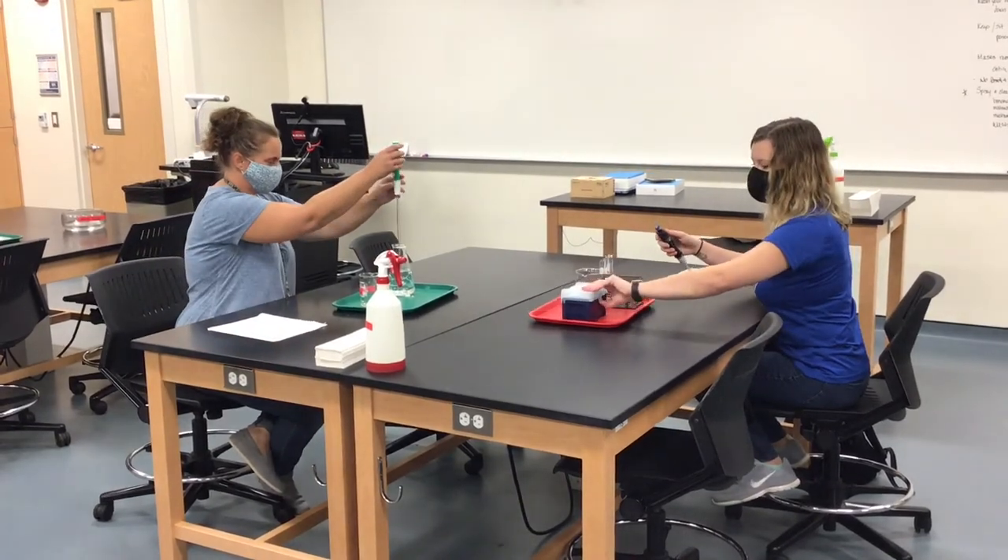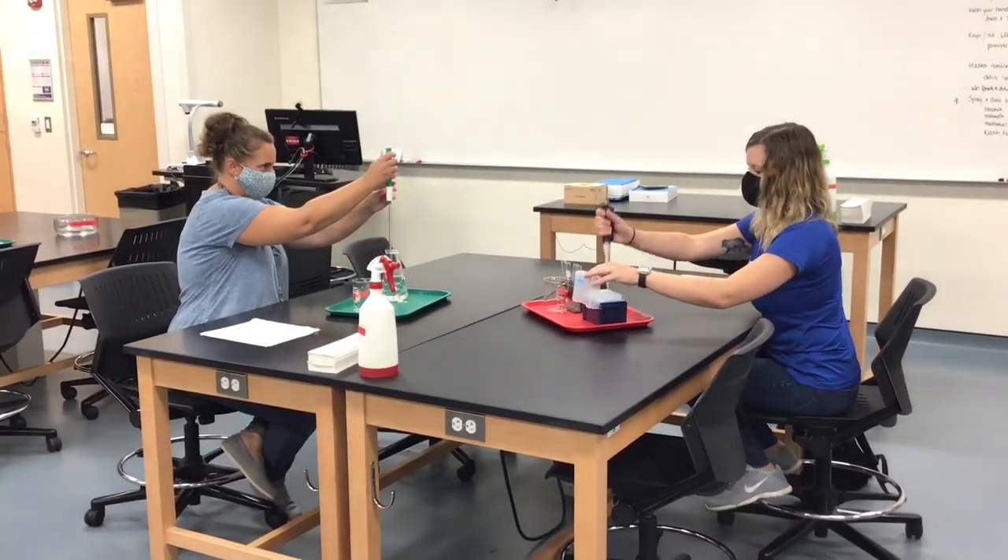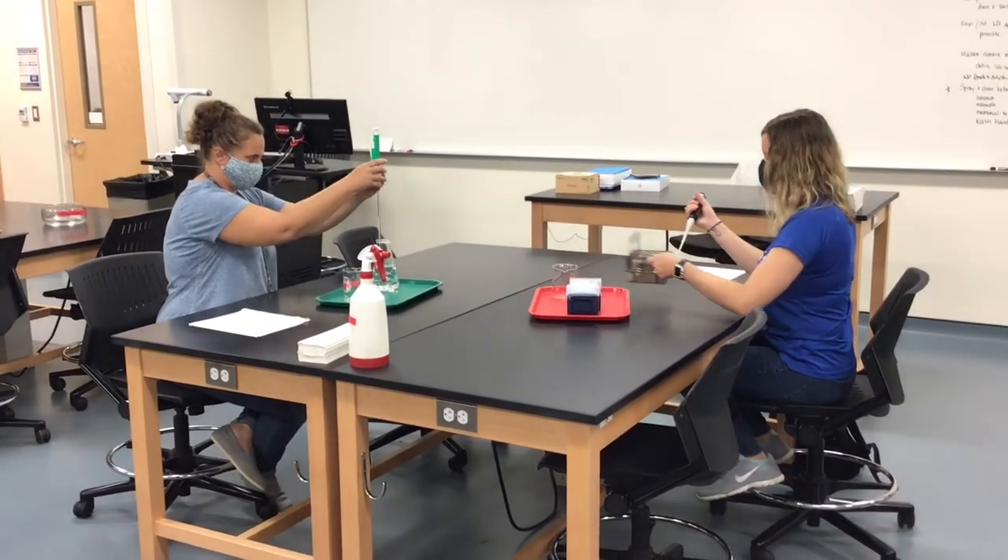As you're working on things in the lab, as a reminder, please keep your mask on at all times and maintain your distance as much as possible.